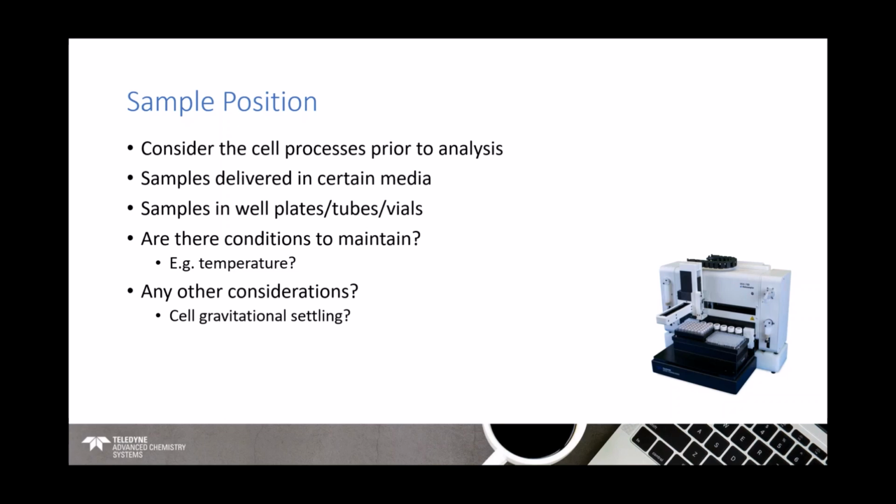There's also things like the concentration of the cells in your sample, because if you have too many cells in your samples, you introduce it to your ICP-MS, you're going to overwhelm the actual measurement side of things, and it might be less easy to detect the data that you want out of this.